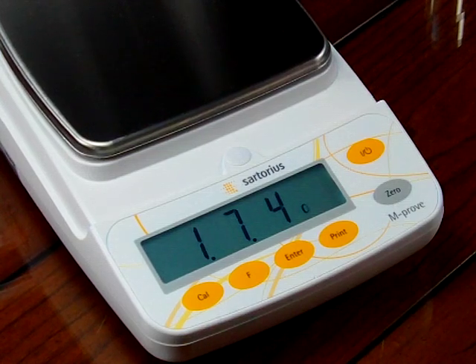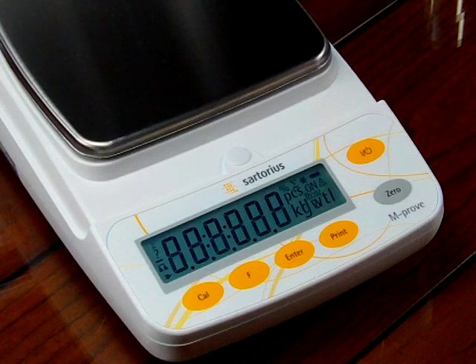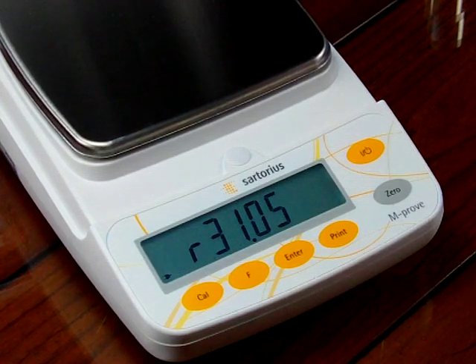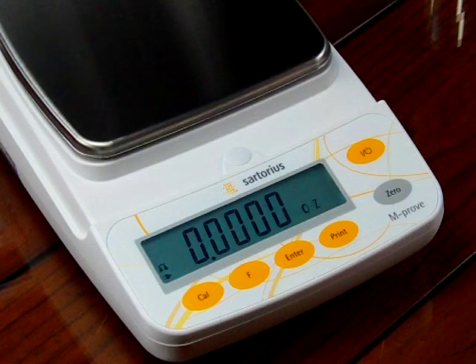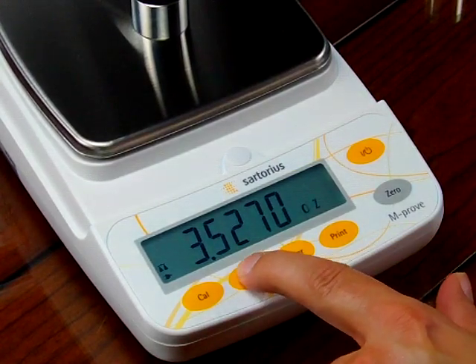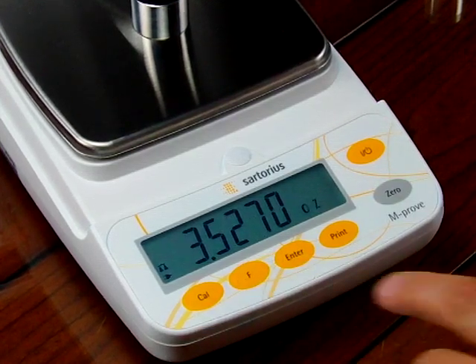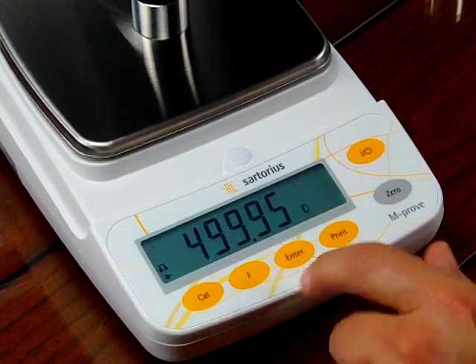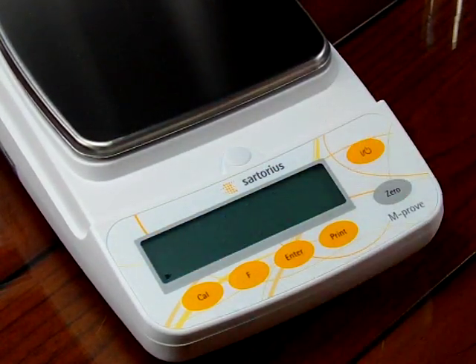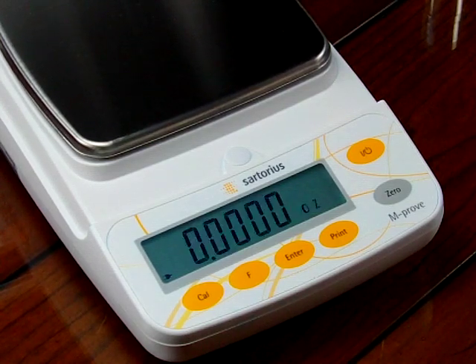Now I need to reset the balance. To save and confirm everything, I press and hold down the zero key and the balance resets. When the balance powers back up, we're going to see that the balance is now in ounces as the secondary mode. If I press the F key, now we're in carats — that little circle symbol means carats. So now we're in ounces and carats. If I shut off the balance altogether and power it back up, the balance always powers up in the secondary weigh mode, which is ounces.